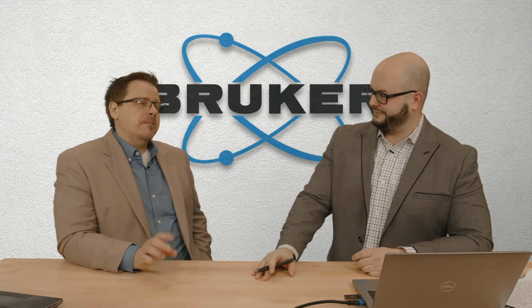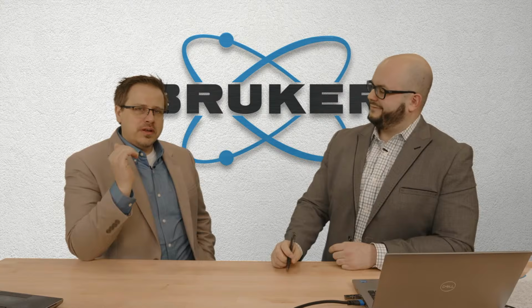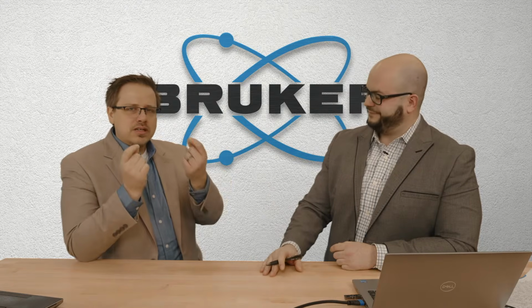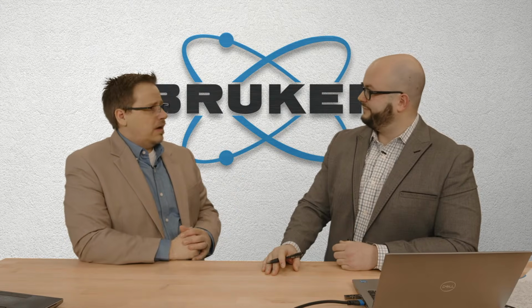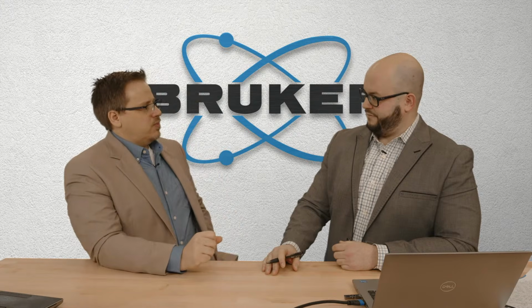For me, the configuration I really like is generally a point focus tube and then a set of pinhole slits, because then I can change my radiation. I can go copper if I want. If I'm going to measure steel, I can throw in a chrome tube. And that'll give me a nice, say, 1 millimeter size beam.